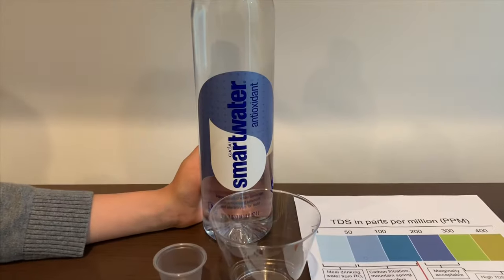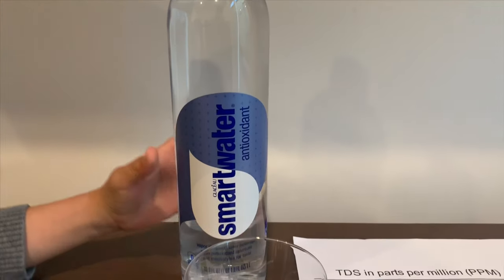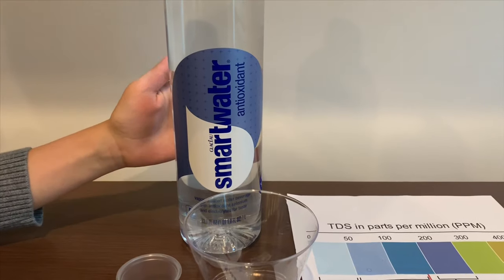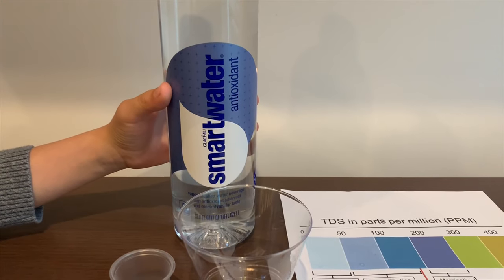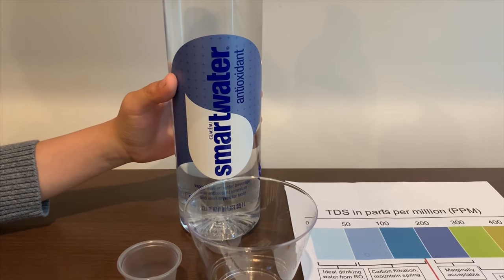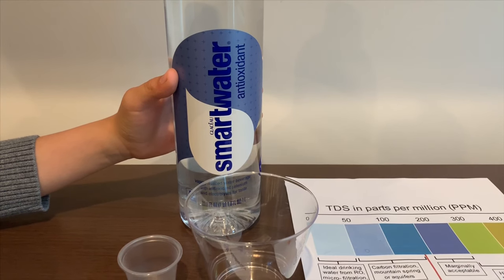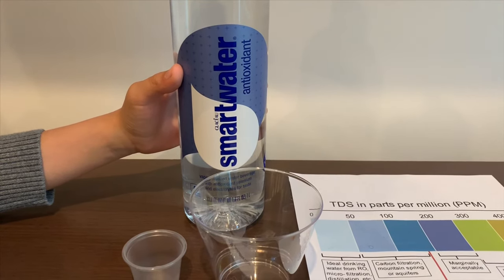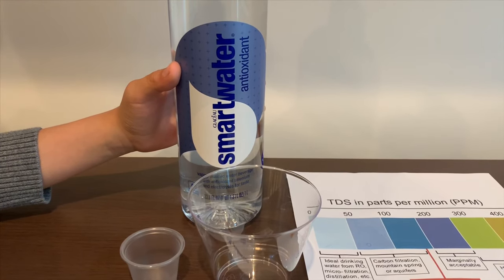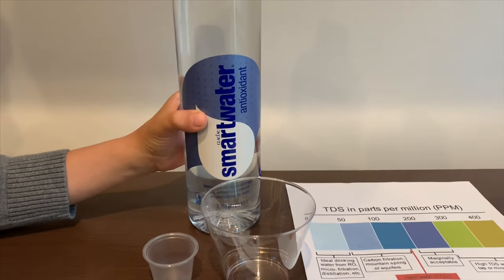This is SmartWater Antioxidant. It cost $2. Remember, we tested the SmartWater Alkaline and the original version — the original had a TDS of 27 and the alkaline had 46. Their pHs were 4.5 for the original and 9 for the alkaline. Let's see how this one compares.